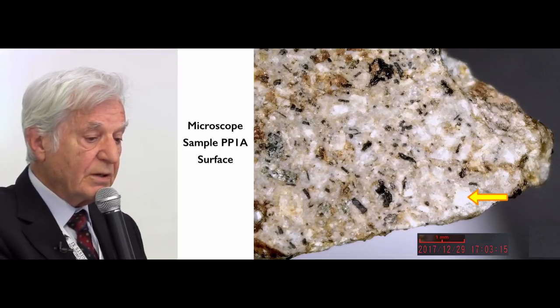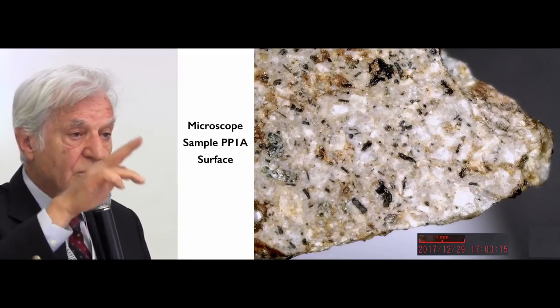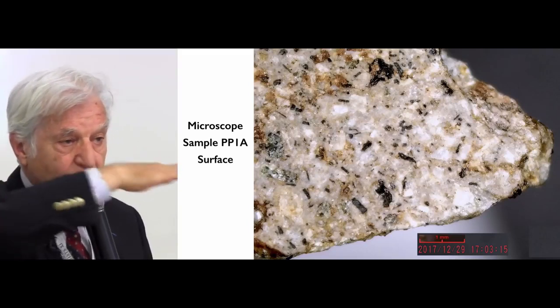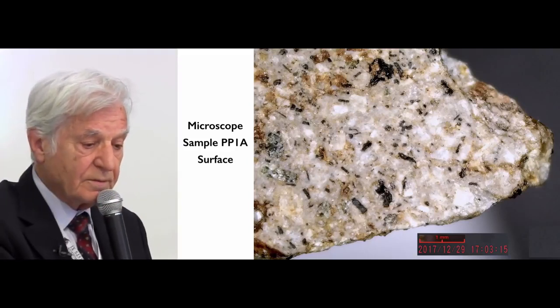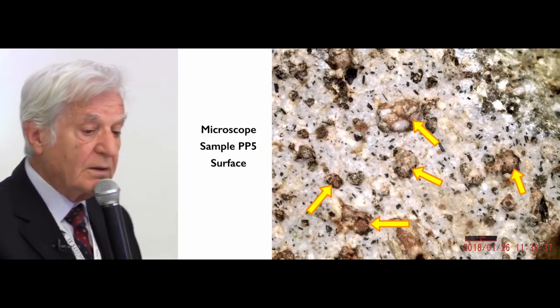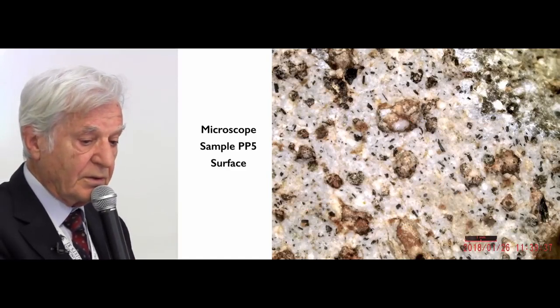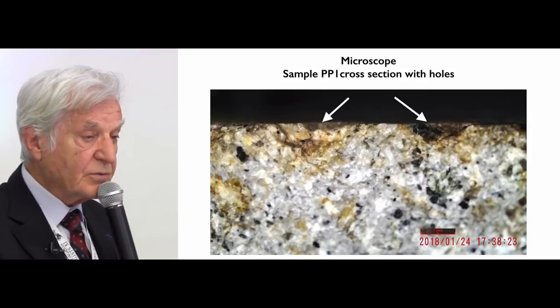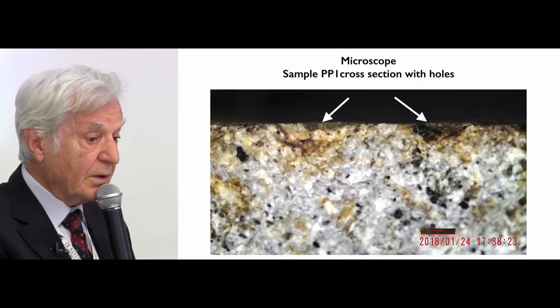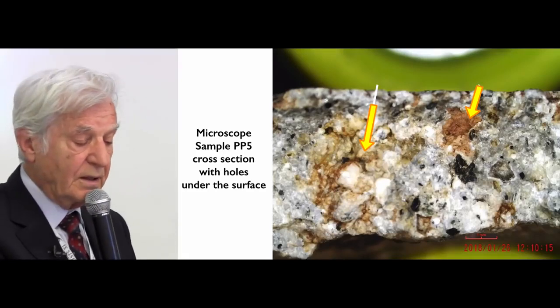What you have here, you see in white, these are the plagioclase crystals, and in between we have holes that are in different colors. It is a surface that is very plain, uniform, leveled, but full of holes. This is PP5. We have the white plagioclase, and in between holes that are 0.2 to 0.5 millimeters deep with clear walls, and underneath we see the crystals of the material. If we look on the cross section, you see on the surface the holes up to 0.5 millimeter depths. But in another cross-section, we have the holes inside. So this is a material that is typical for these artifacts.